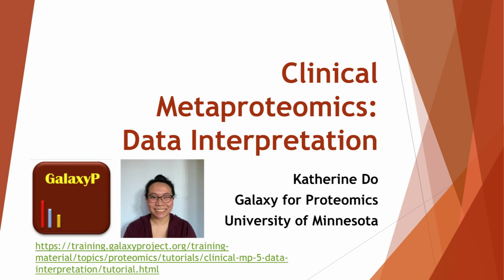My name is Katherine Do, and welcome to the last video for the Clinical Metaproteomics tutorial. In this video, we will cover Module 5, Data Interpretation. Previous videos covered background in Modules 1 through 4, so please watch those to prepare for this video.